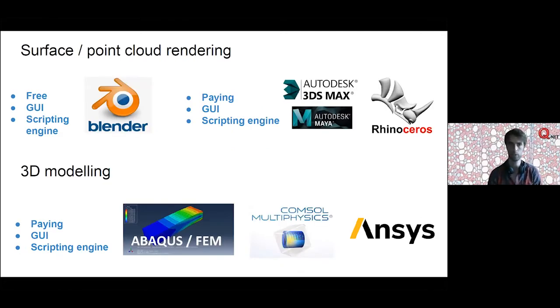I'm not going to go into detail on surface and point cloud rendering, because for that you have different packages, and it is most of the time less of an interest in terms of quantitative wood anatomy and 3D data gathering, because we're talking about volume data, not surface data. And then we had a very specific question on the 3D modeling, actually, the biomechanical modeling from a nanoscale to a micro scale. That's a very hard question to answer. I'm not a biomechanical engineer, so I cannot say for sure, but I don't think there is a dedicated package to do that.